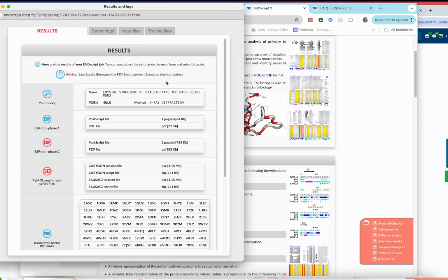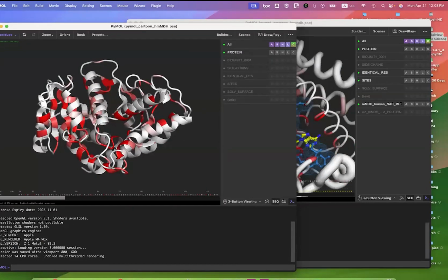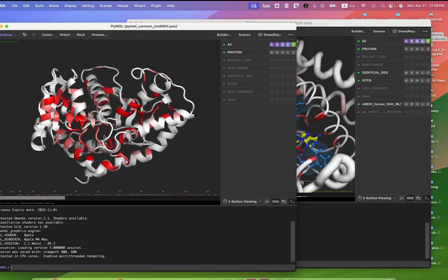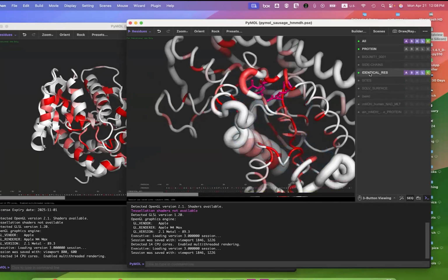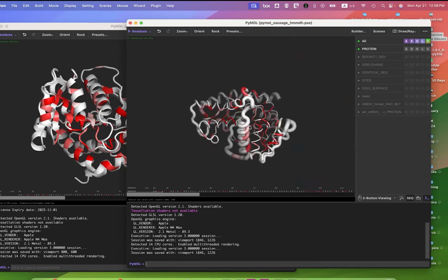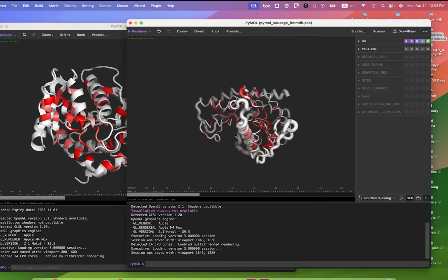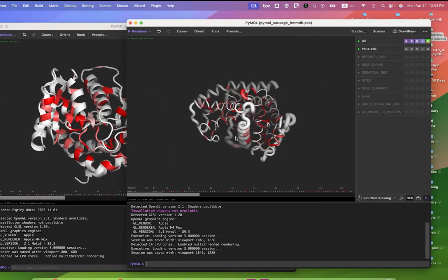And what you have is these PyMOL files, and there's two PyMOL files. PyMOL is a structural visualization software. One of them is going to be just a normal looking cartoon, except it's colored by its conservation. And another one is going to be, let me just turn off the stuff that is not, just like a sausage. So here's a sausage where if it's a thicker sausage, that means that the positions of those residues are more variable in the different structures. And so that might indicate structural flexibility, or just variations in the structure.